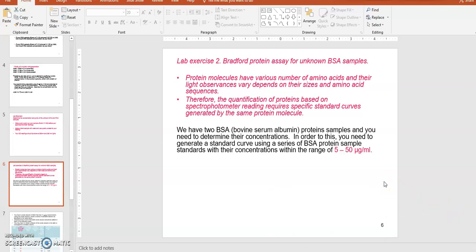Instead, you use a color dye that can bind with protein molecules, and then use that dye in your spectrophotometry, because there should be a correlation between the amount of dye stuck on your protein. Based on that chromogenic substance, you can detect their concentration using visible light. That's how you do this.